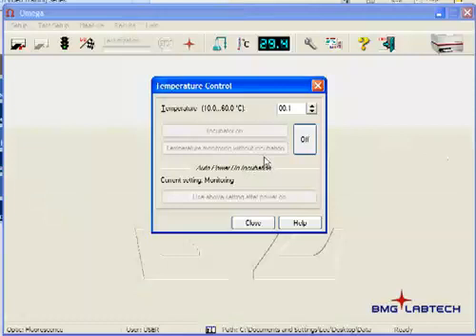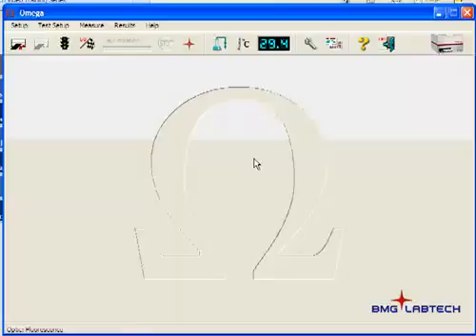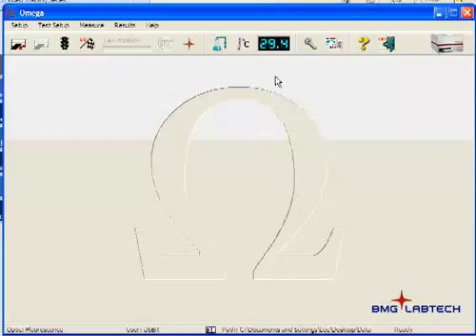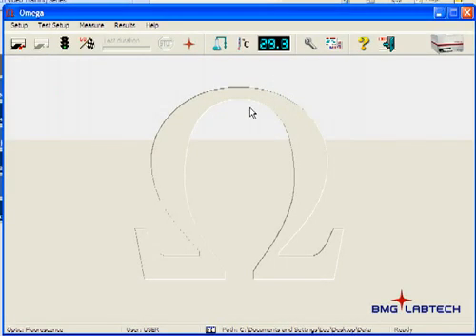I'm going to click on that and then close, and it will automatically have this selected and chosen when I open up the software. So that's the basics for the temperature monitoring incubation software, pretty easy to use.